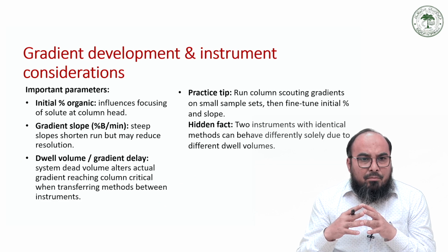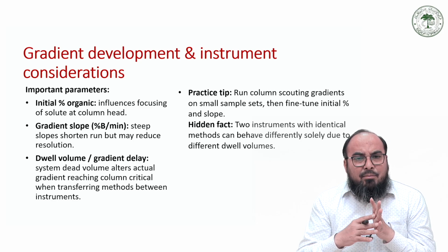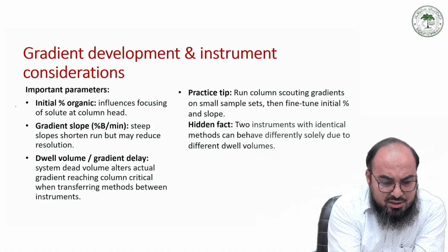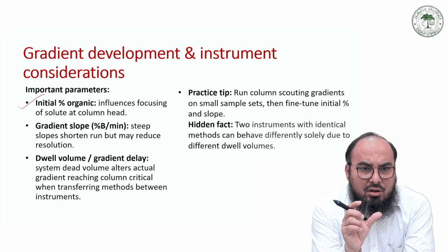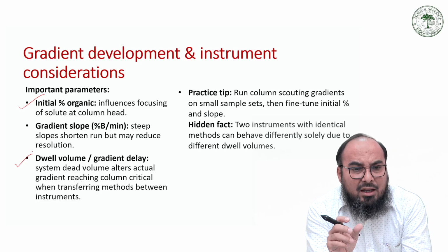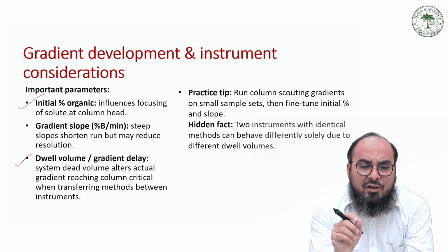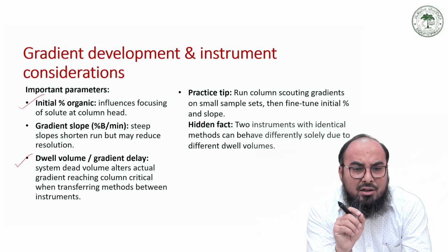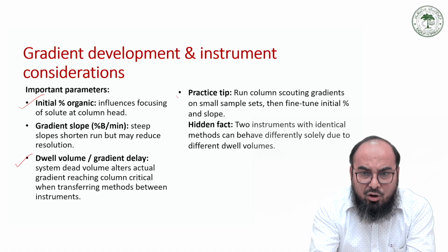So what are the parameters? Let us quickly look into it. The important parameters: it influences the focusing of solute at the column head. So dwell volume is there. Again, it is the dead volume, and it actually alters the gradient reaching the column head. So it actually changes.